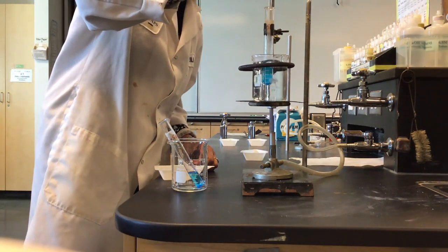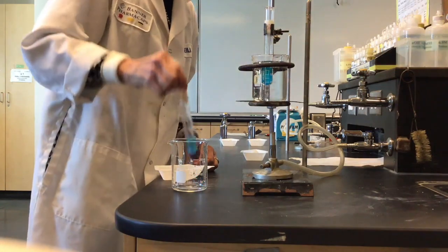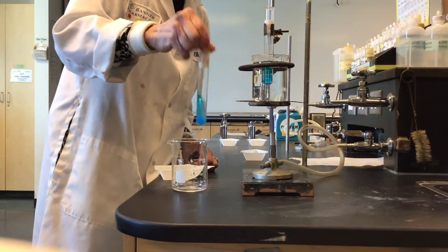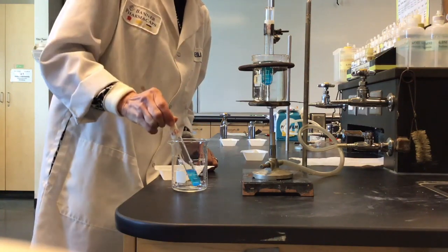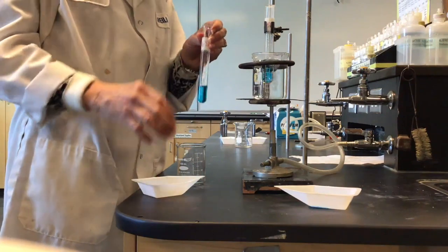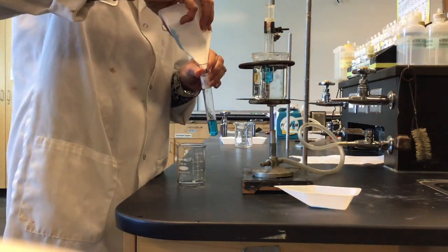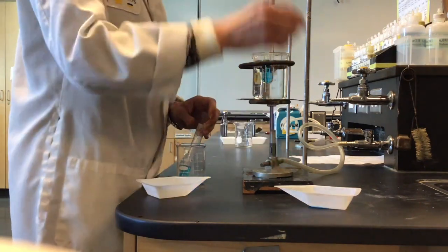So the idea here is you're just going to keep adding these 0.5 grams of copper sulfate pentahydrate until your sample will no longer dissolve. And that's the mass that you'll record in your notebook. So both our samples are dissolved again. So now I'm going to go ahead and add the third increment of 0.5 grams to each of our samples.